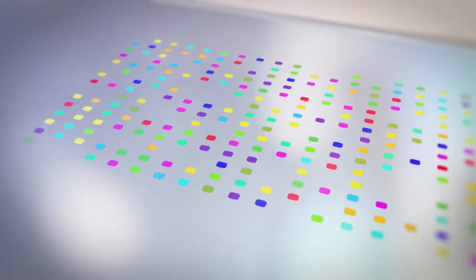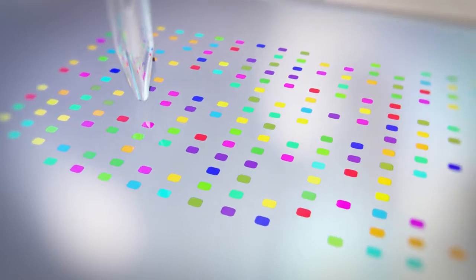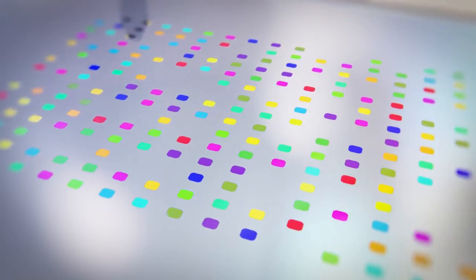In our lab, we have developed a microfluidic device for the high-throughput screening of receptor arrays.